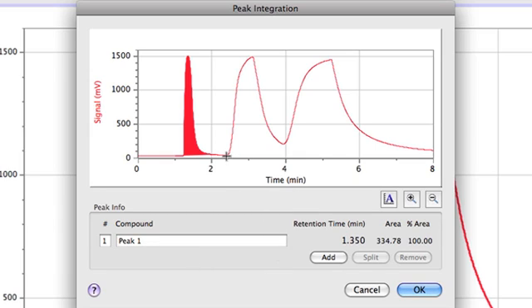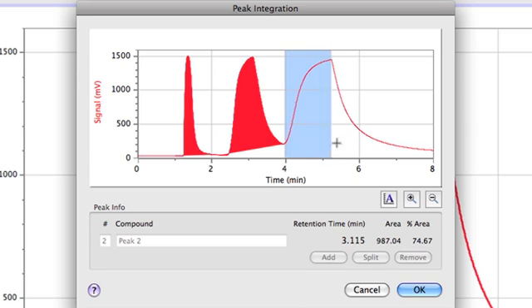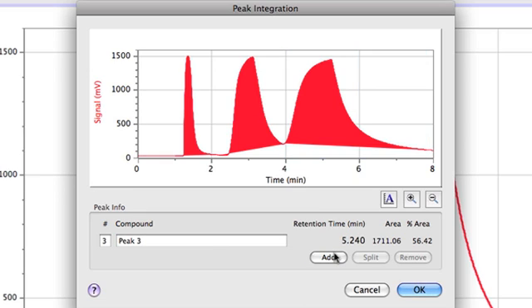For the second peak, I do the same thing. I place my cursor on one side of the peak and drag to capture the region around the second peak and click add again. This is peak two. And notice that I've got a retention time and a peak area calculated. And then I will do the same thing for the third peak. And click add one last time.